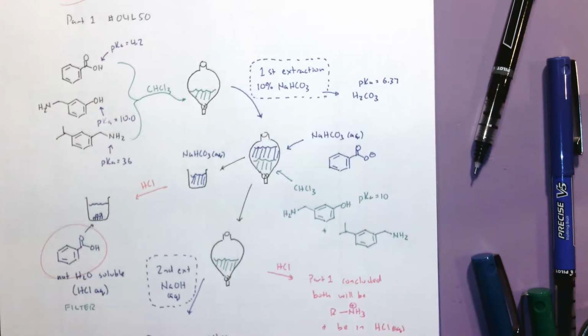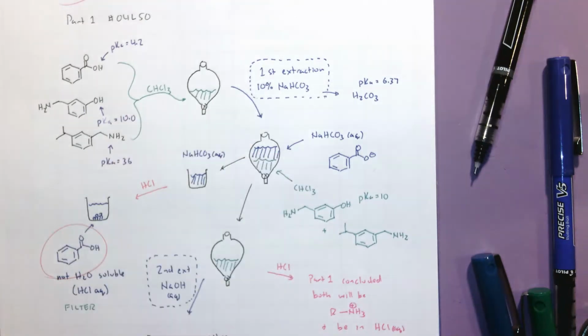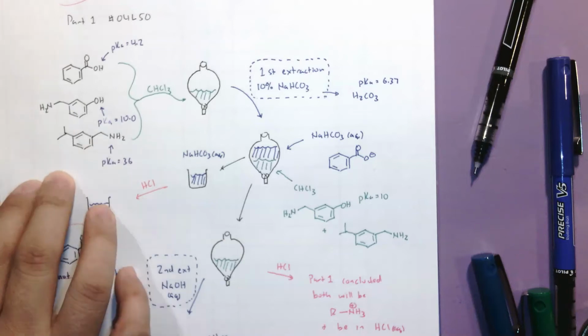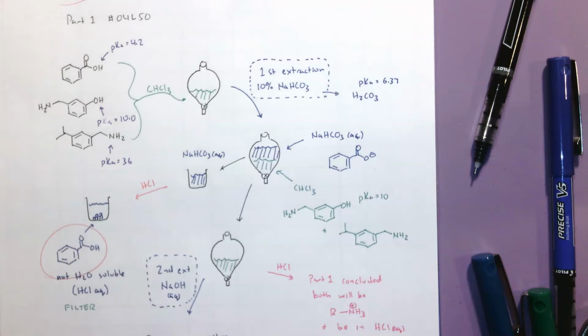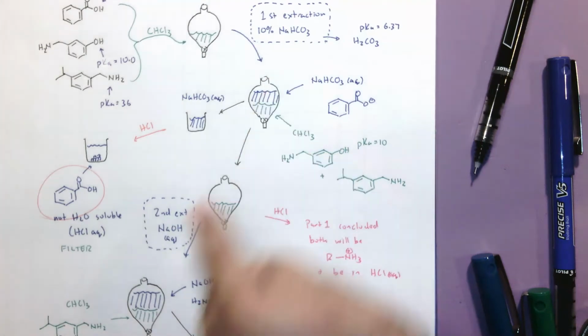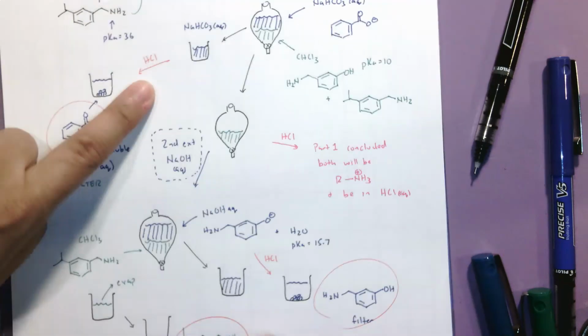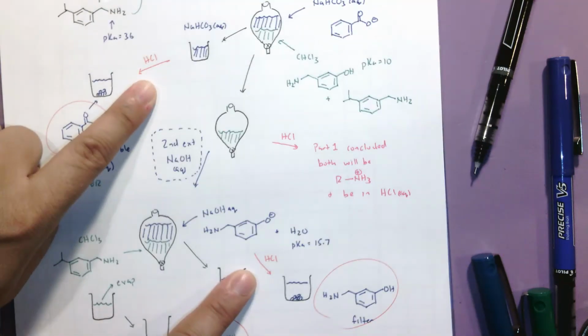Now, let's say you let this sit for a month or so, get more comfortable with organic chemistry. I bet you can think of other ways, other sequences of acidic water and basic water to try to separate these three. There's often several different ways to do an acid-base extraction, but we were able to do this pretty well with only 2 extractions, 1 and 2, and with our acid neutralizations, these two that I'm pointing at.